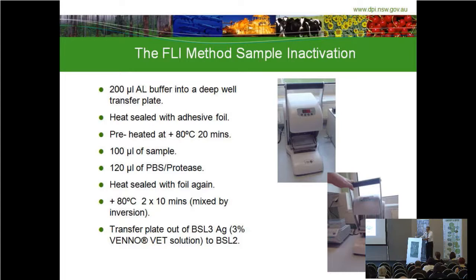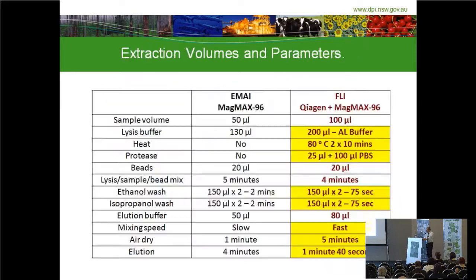And I know there's a presentation later on the use of other sample buffers to inactivate virus, because we had a similar idea that we could really inactivate these samples fairly easily. Don't worry about the detail, but this is our standard MagMax protocol on the left, and the yellow is the differences between what was used in the FMD lab, so it was quite different volumes.